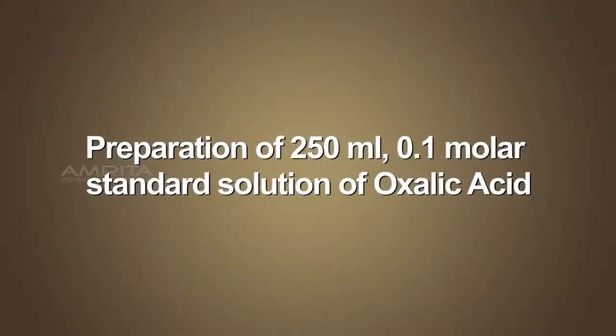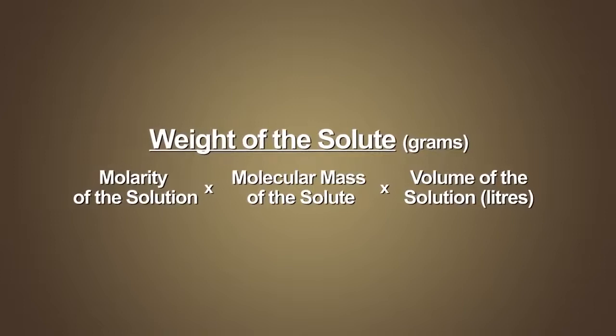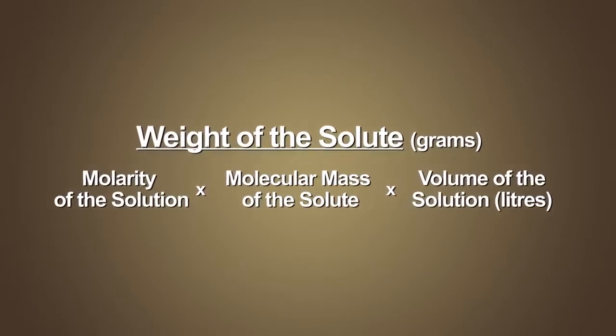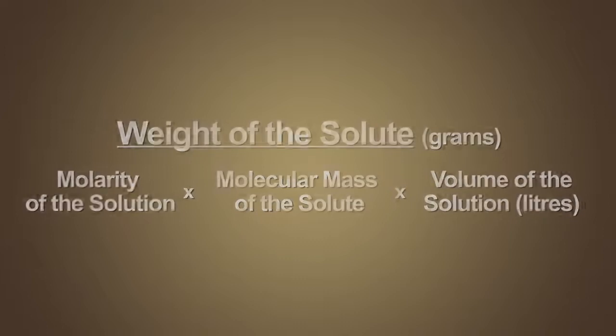Procedure: preparation of 250 ml 0.1 molar standard solution of oxalic acid. The weight of a solute required to prepare a standard solution is equal to the molarity of the solution into molecular mass of the solute into volume of the solution in liters.